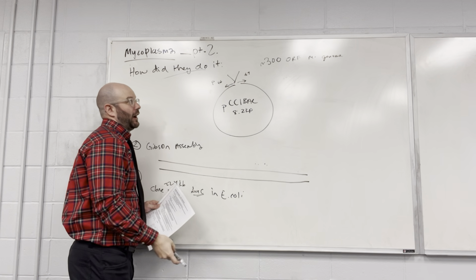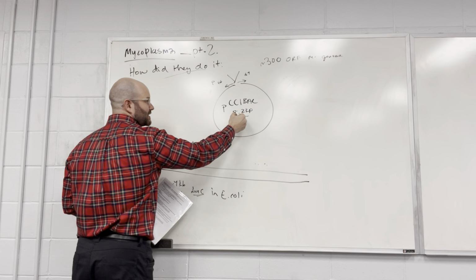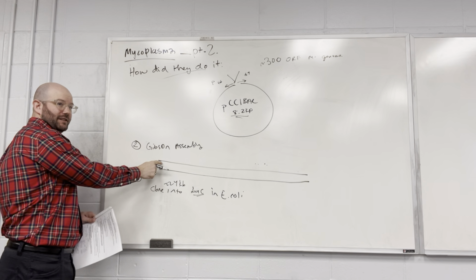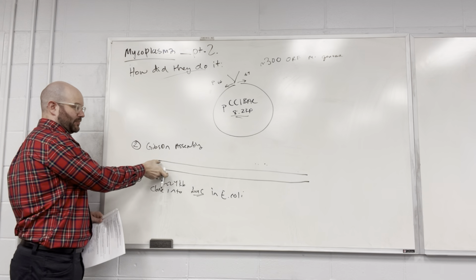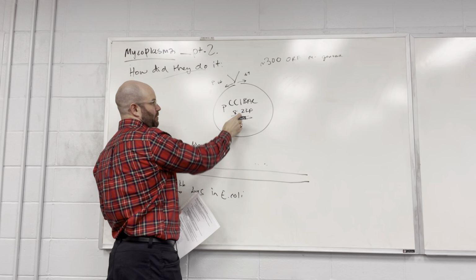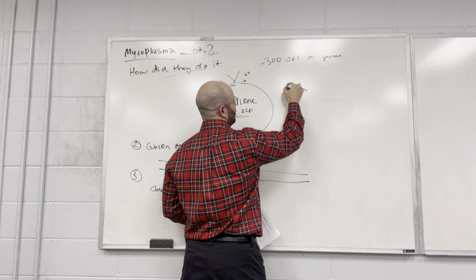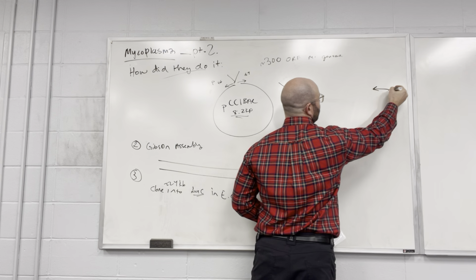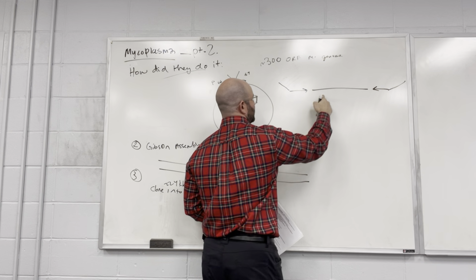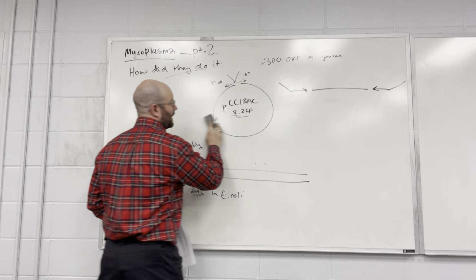And what are they amplifying? This. So they're PCRing the BAC backbone, not their Gibson assembled large chunk. So they essentially create an amplicon that looks like this. Imagine this is now not circular anymore, it's linearized.